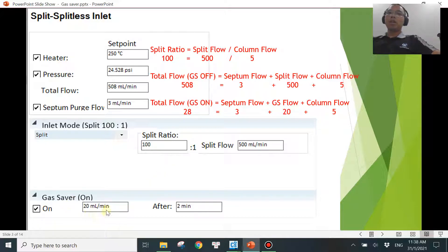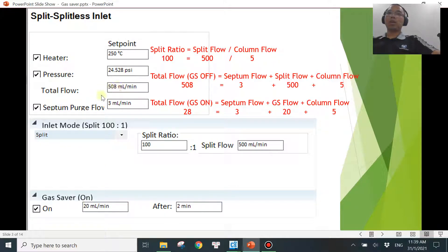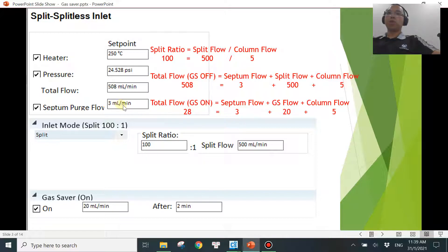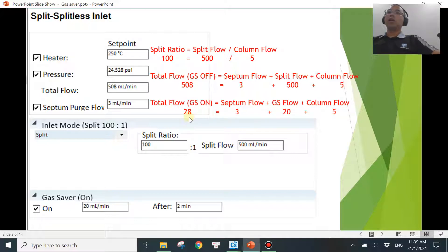What I want to show you is that the gas saver flow rate shown here will replace the split flow rate when gas saver mode is on. Whenever you turn on gas saver mode, this flow rate jumps in place of the split flow. I've seen a lot of confusion where people think this is the total flow rate — it is not. The septum flow rate stays at 3 mL/min and the column flow rate stays at 5 mL/min. The split flow becomes the gas saver flow, which we've set at 20 mL/min. So the total becomes 3 + 20 + 5 = 28 mL/min.